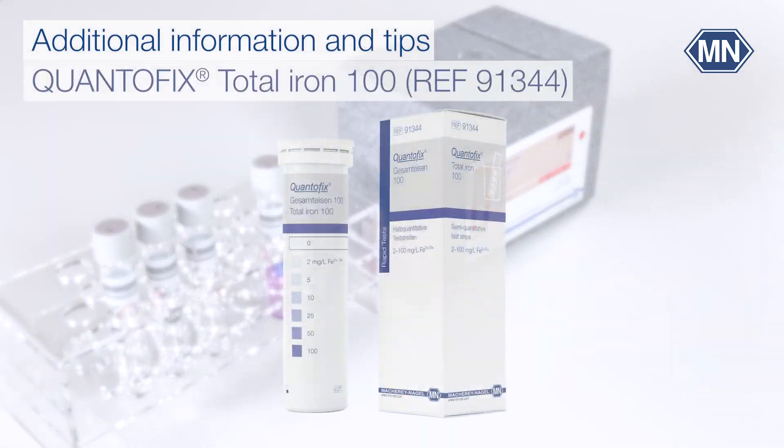A pretest with Quantofix Total Iron 100 gives information about the order of magnitude of the iron concentration in the sample. The sample may need to be diluted to match the measuring range.